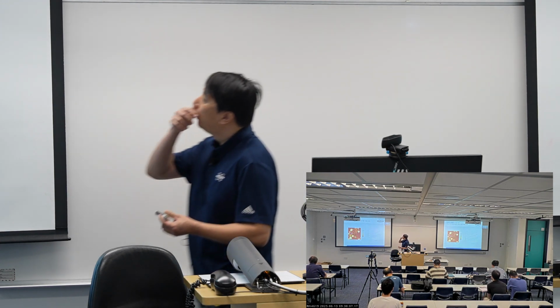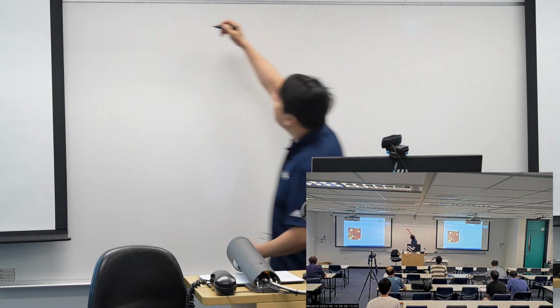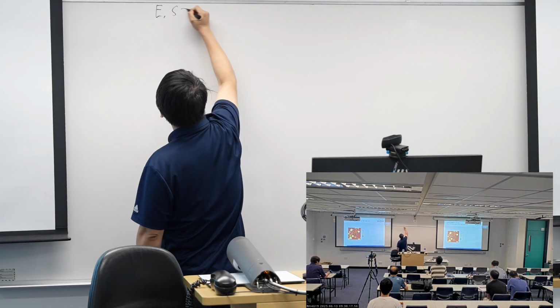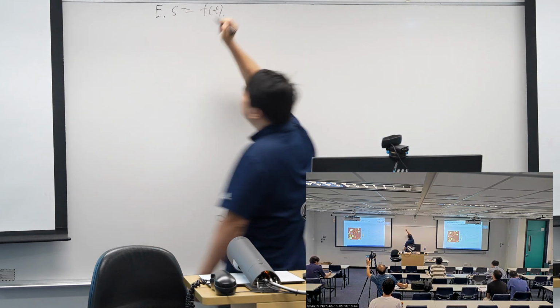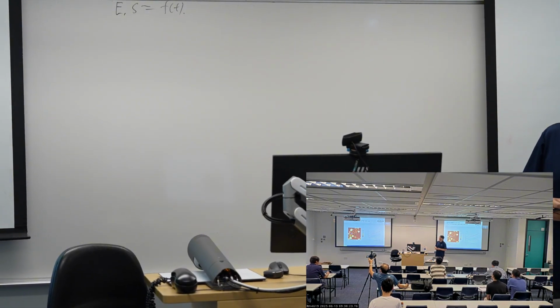So as we said yesterday, we have some materials. Its modulus or stiffness is a function of time. As such, we can describe how it changes against the time.